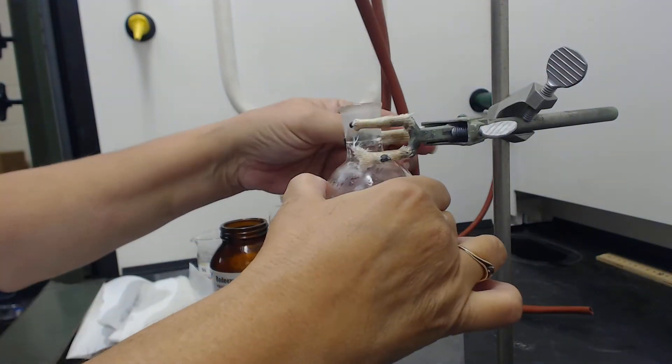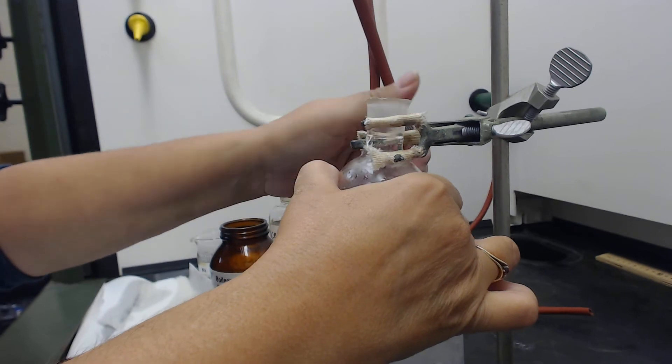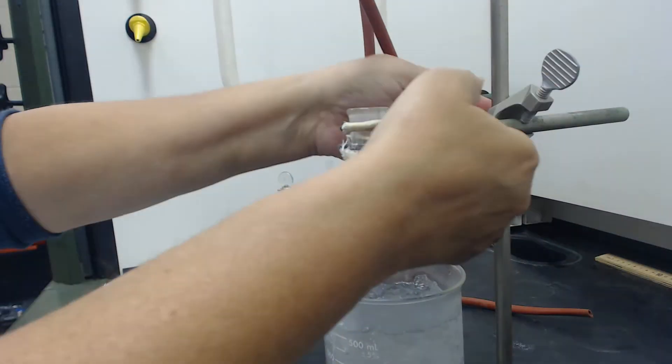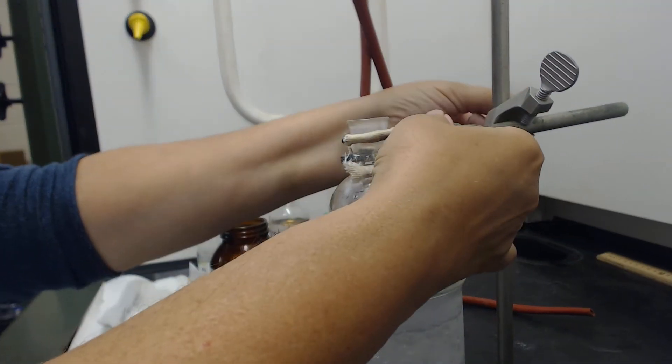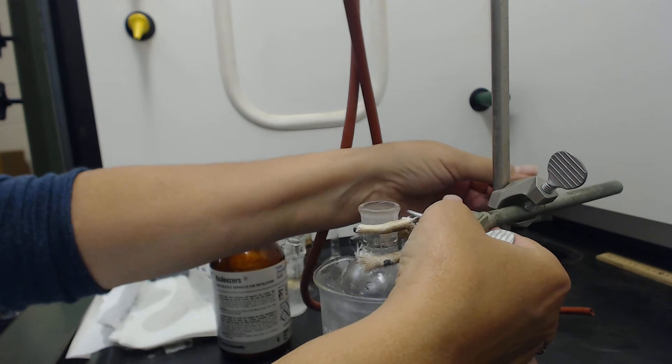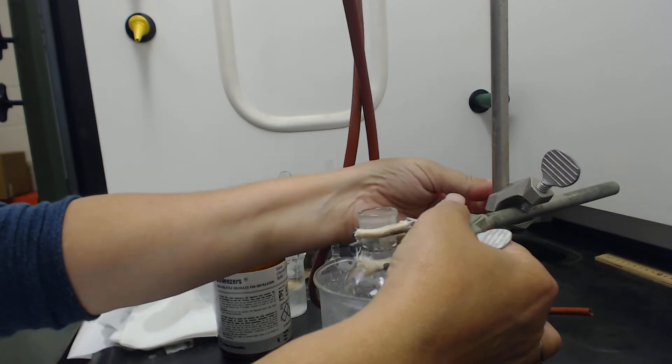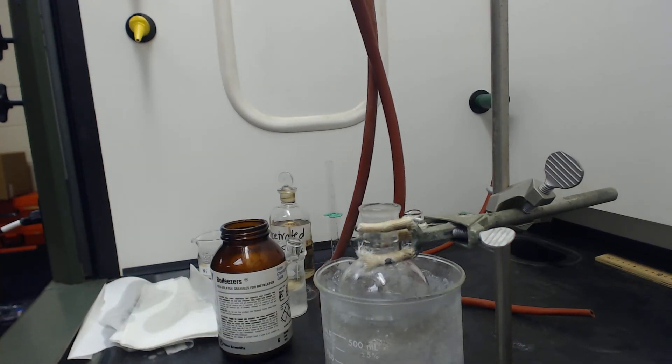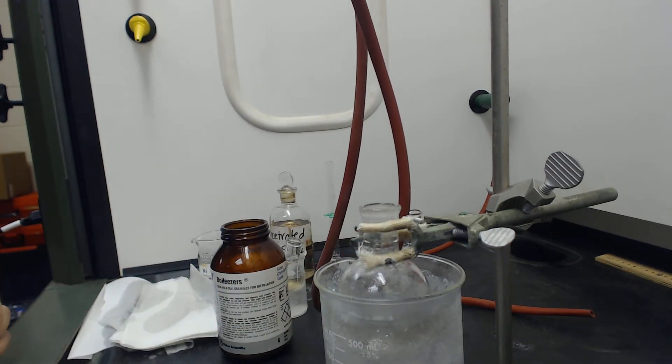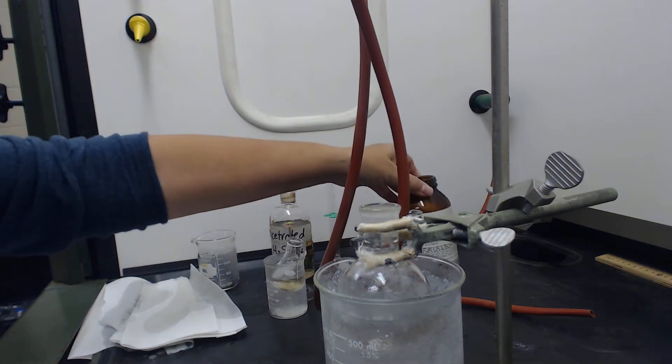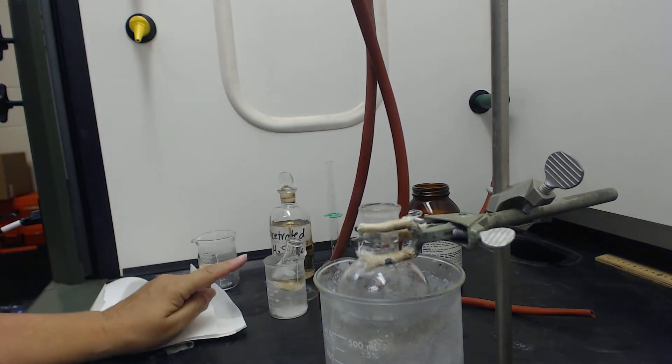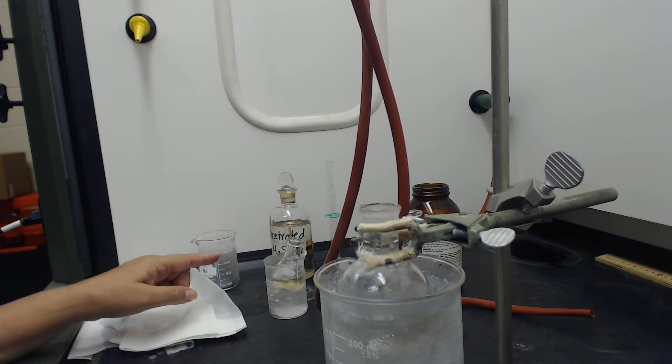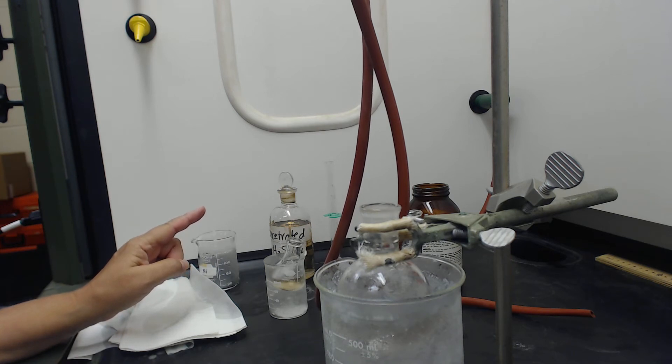Now what I'm going to do is put it into an ice bath. The reason why is because I'm going to add sulfuric acid. This is a pretty exothermic reaction when I add these together, so we want to make sure that it doesn't get too hot. I've already been cooling 11 mL of concentrated sulfuric acid in its own ice bath.